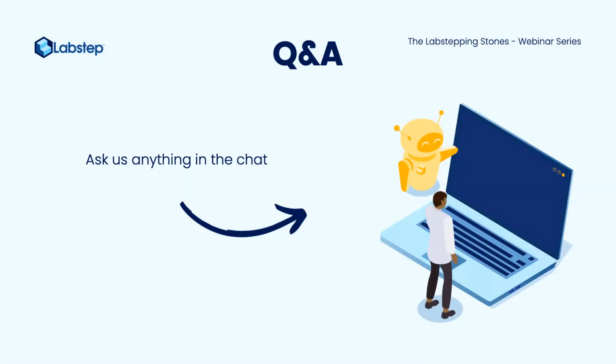But basically, if you're wondering what to do next after this webinar, what we recommend is to apply what you've learned, share all of this information with your collaborators, and rewatch the webinar as well. It will be available on demand. And obviously sign up to our next webinar. Like I said, it will be on a more advanced side of the inventory module, and we'll dive deeper into more advanced knowledge, like lineage tracking, device client, and order management.